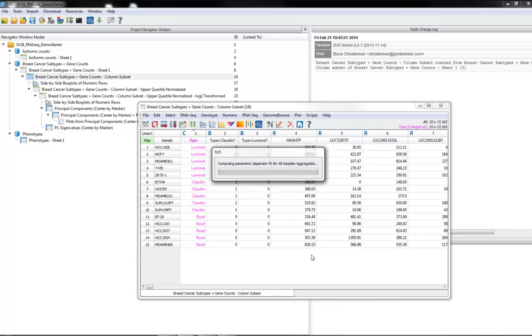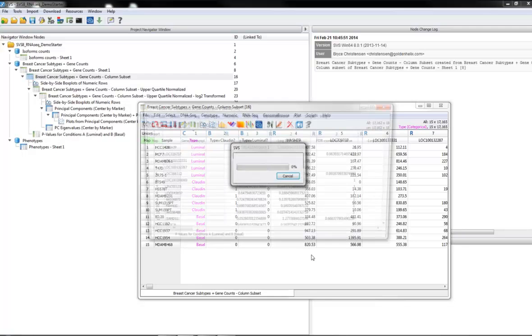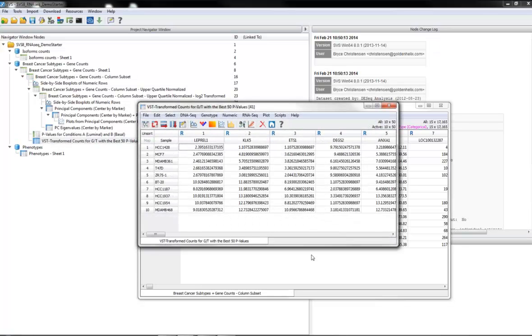Now, the reason I went back to the pre-normalized data is because DE-seq does its own normalization process. If you look at the online tutorial for RNA-seq analysis, it gives a few notes about different input types, when you do and don't want to use different normalizations. There's really not a lot to it there, but depending on whether you're coming from RSEM or cufflinks, and if you have FPKMs or something else, you may want to use some different options. And again, that's laid out in the tutorials.